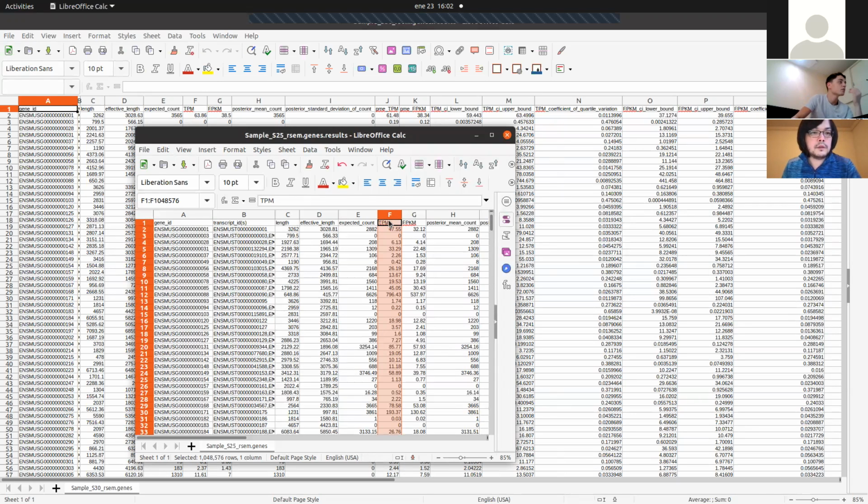And one of the drugs in this treatment is pleiotropic, so I imagine it's going to have an effect on everything. It's a histone deacetylase inhibitor that opens up chromatin and it should increase expression of most genes. So yes, I see there's an increase in expression.